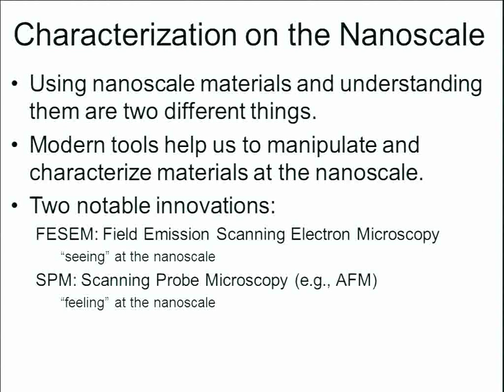And then scanning probe microscopes, or SPMs, which kind of allow us to feel at the nanoscale. They involve a probe interacting and kind of feeling a force between the probe and the sample below.